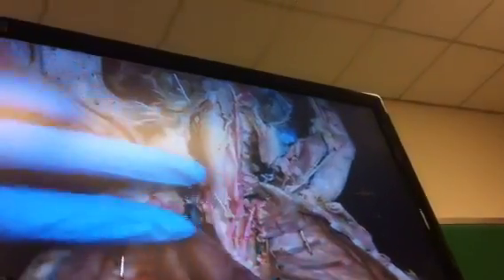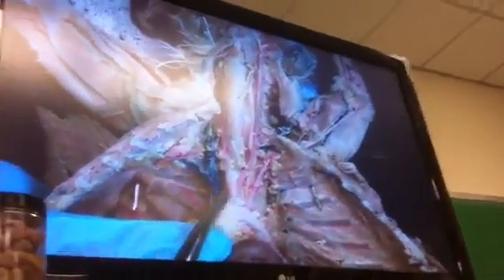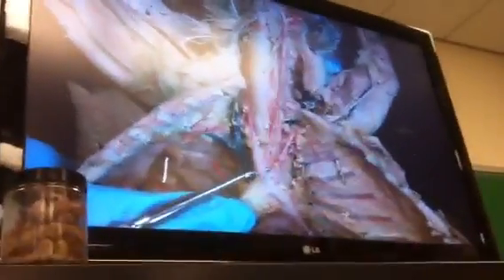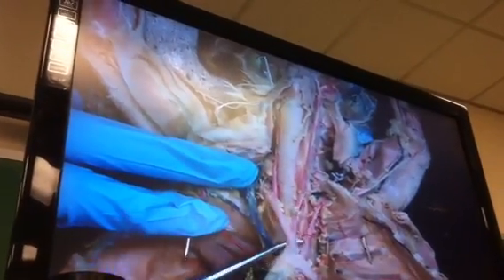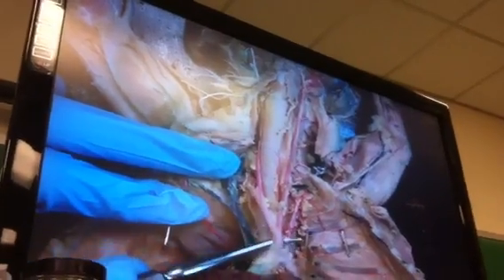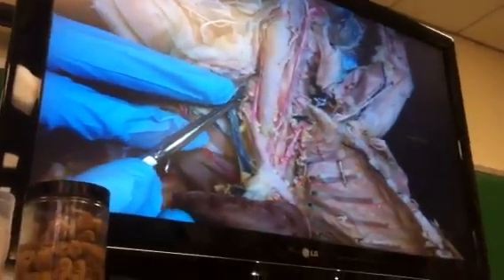Let's keep going. The first structure that we're going to see come off the arch of the aorta is this right here — it's called the brachiocephalic artery. So if that's the brachiocephalic artery, the one that goes toward the right, this is the subclavian artery going into the arm.